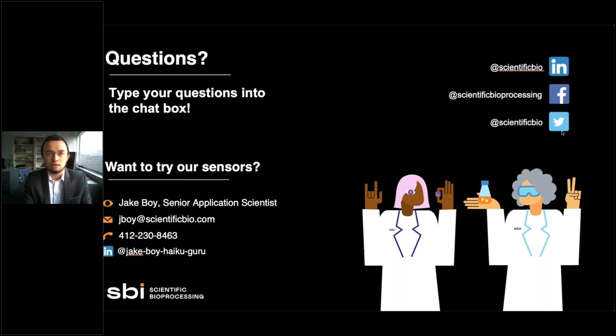Yeah, well, the main application that we are aiming for with this technology in this case in particular is to use these chips as a tool for exploring biological systems and microenvironments that are just harder to access in vivo, right? I'm pretty sure that there are applications for oxygen sensing during more clinical situations, for example, during surgery. But the one that we are using right now is basically in order to improve drug development and improve our understanding of different pathologies that include, for example, gastroenterological pathologies. And so, yeah, the applications are broad, and it's an exciting time to be working in this field.